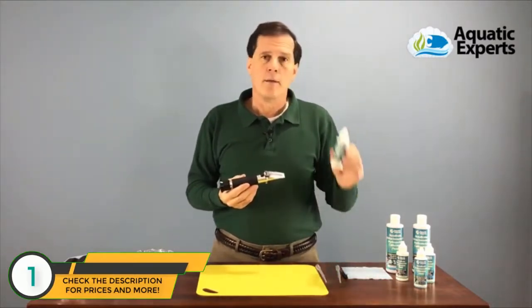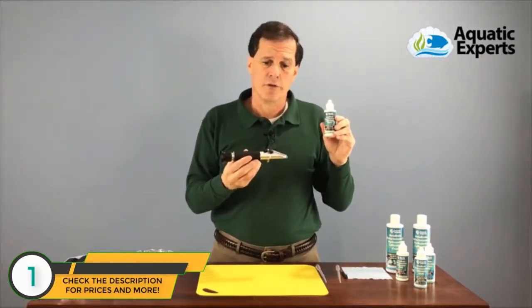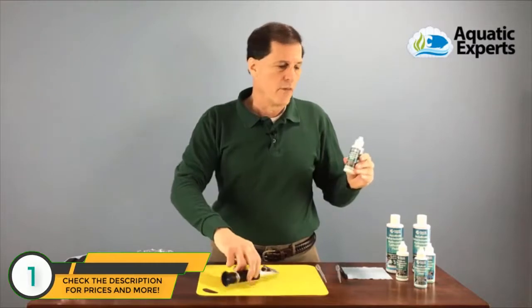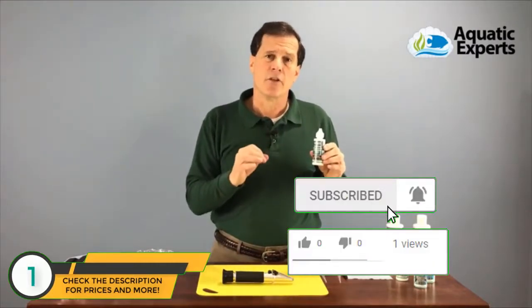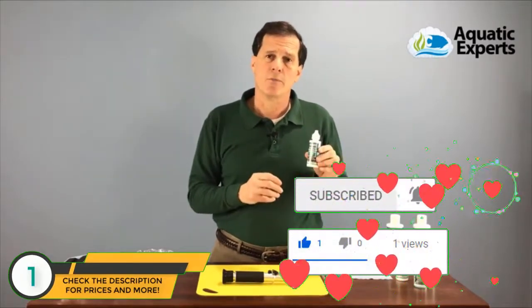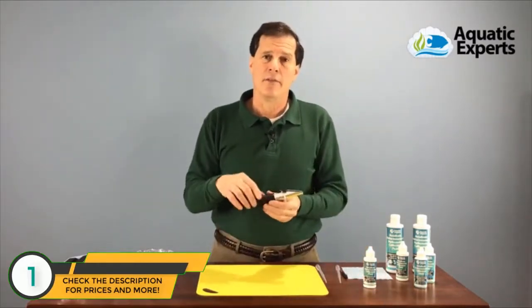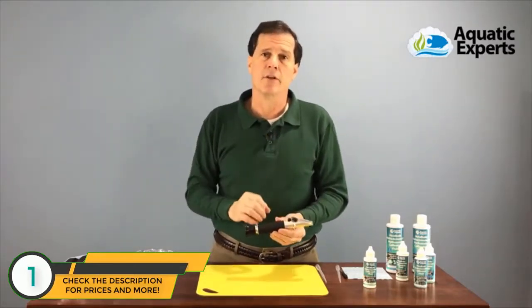We're going to use a product by Aquatic Experts called Accubrate, which will be our calibration solution, and I like to recalibrate my refractometer after every couple of uses. The solution is set at 77 degrees Fahrenheit, with a specific gravity of 1.0264 and a salinity of 35 parts per thousand. Does that mean I need 77-degree water and a 77-degree room for an accurate reading?